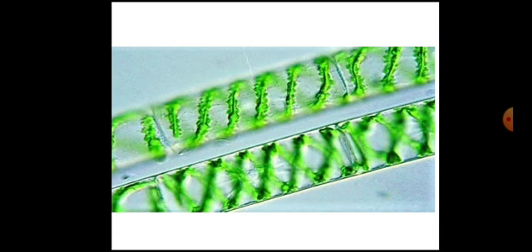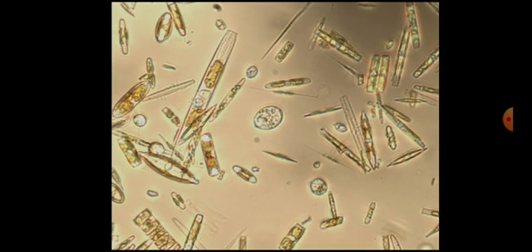This is Spirogyra, and another microscopic picture of diatoms. So this is how diatoms look under the microscope. We can see the different shapes of diatoms under a light microscope.